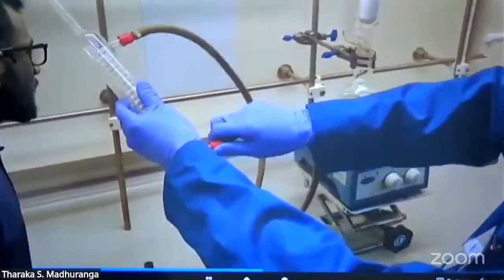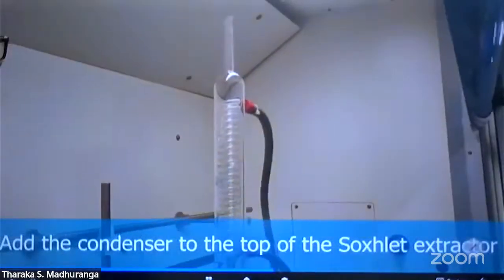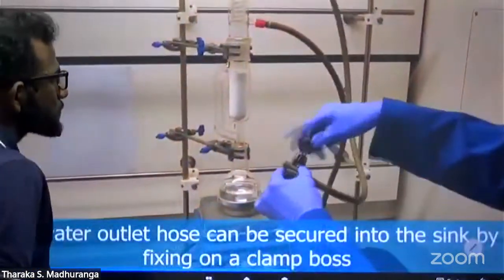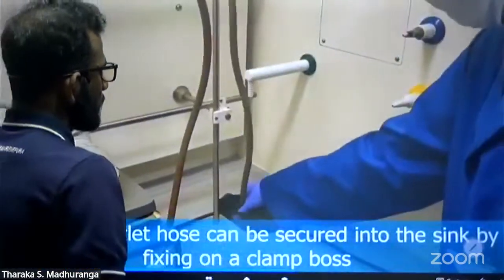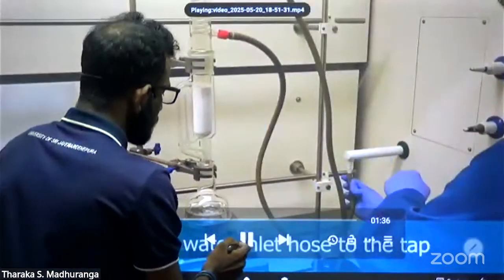Then this is the water supply line and water outlet line. Then we'll see what to do. See carefully, the upper line.